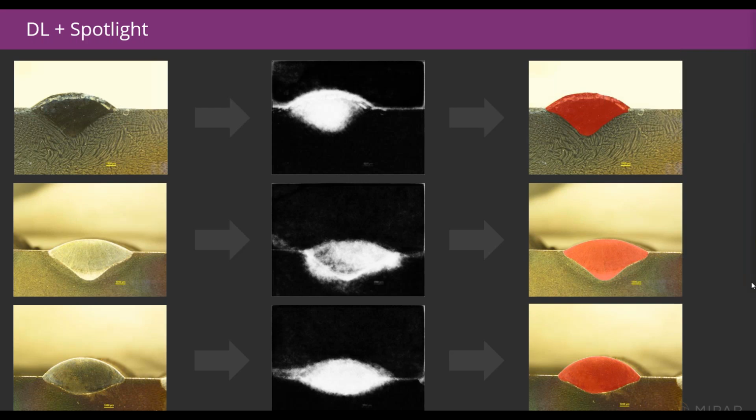I think there was maybe a bit more to the question. Can you do similar analysis on weld crack size measurements? Yes. If it's a feature that you can see in an image that your brain recognizes as a feature with boundaries, then we can almost certainly teach or build a recipe, i.e. configure the software to automatically see and measure it. So yes, weld cracks either within the bead or at the substrate interface or along a joint boundary if you're not using a spot weld.